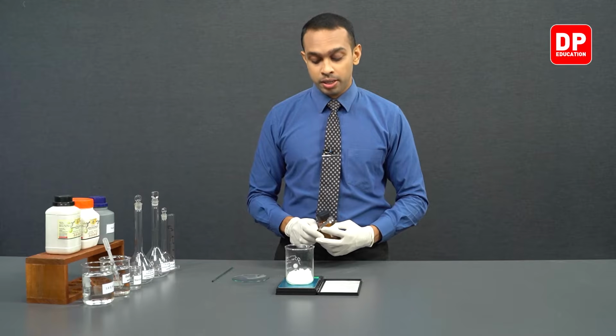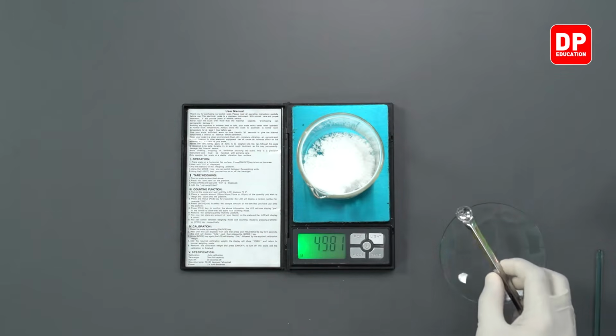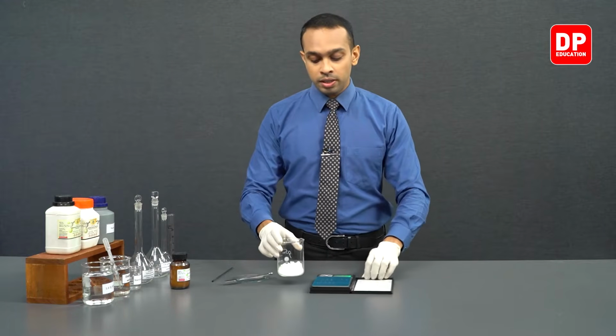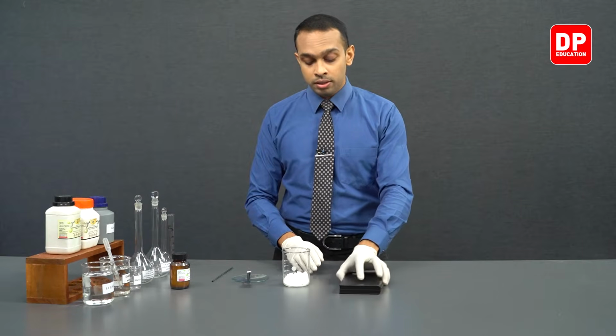Now students, as you can see, we have measured 49.81 grams. After measuring this amount, we can move on to dissolving the potassium iodide with water.